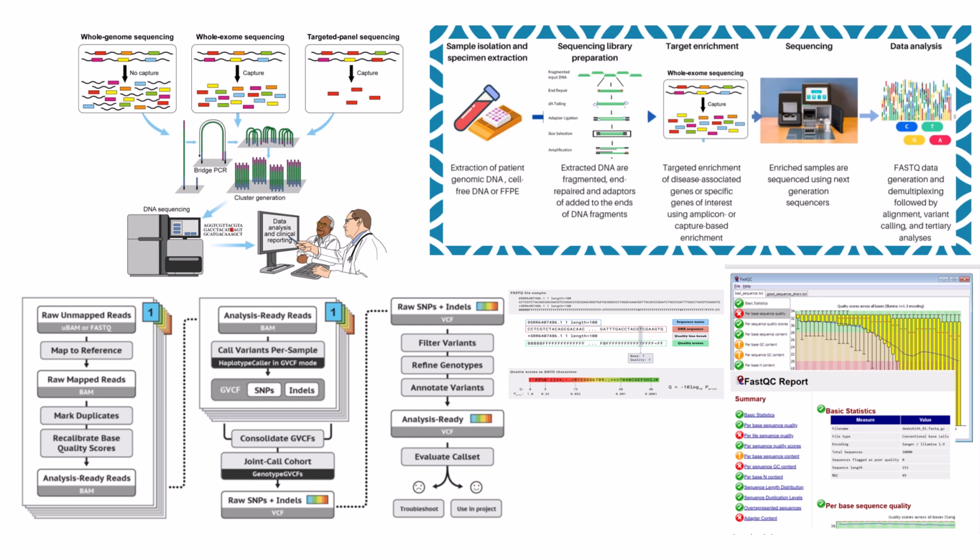Every single spot where the patient might deviate from the standard blueprint. Precisely. It's comprehensive, but it's still considered a raw list at this stage. It contains all the candidate variants the software found based purely on the sequence data. Which means it probably contains mistakes or things that aren't clinically relevant. Exactly. That raw VCF list invariably contains a lot of noise.